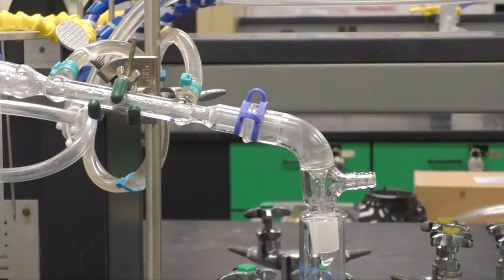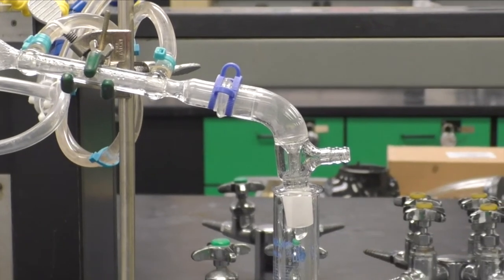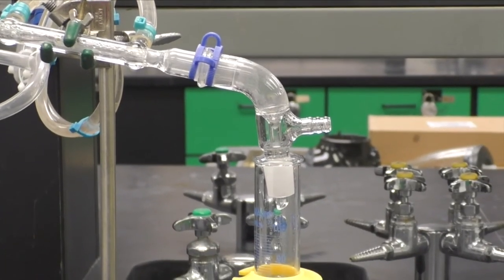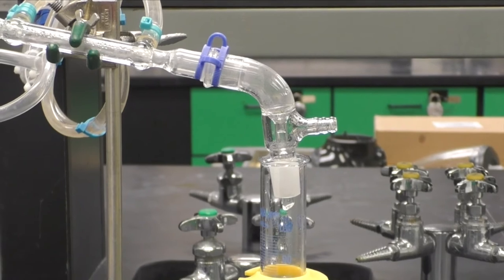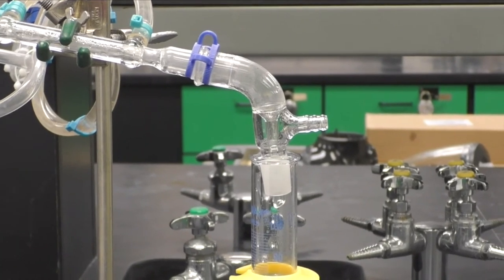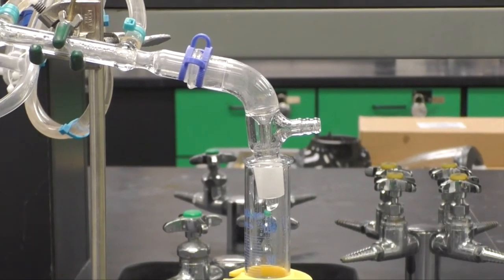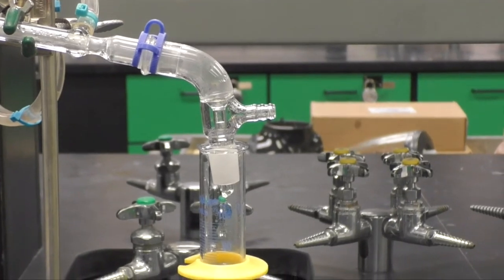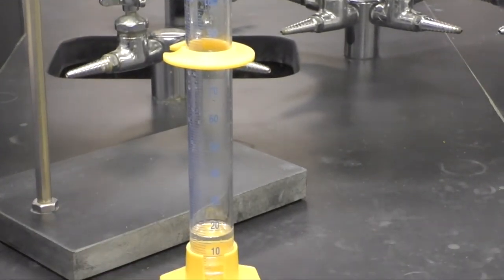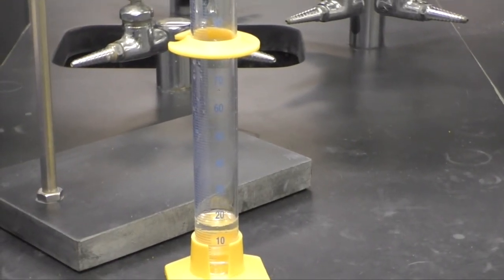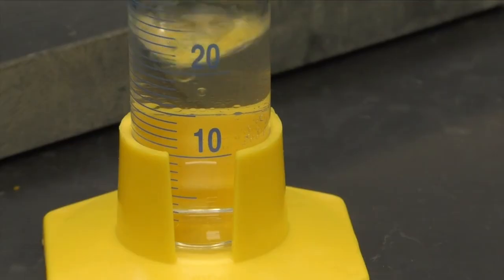As the vapors are cooled in the condenser, they will become liquid again and drip out of the vacuum adapter into the 100 milliliter graduated cylinder. This condensate contains your limonene oil.